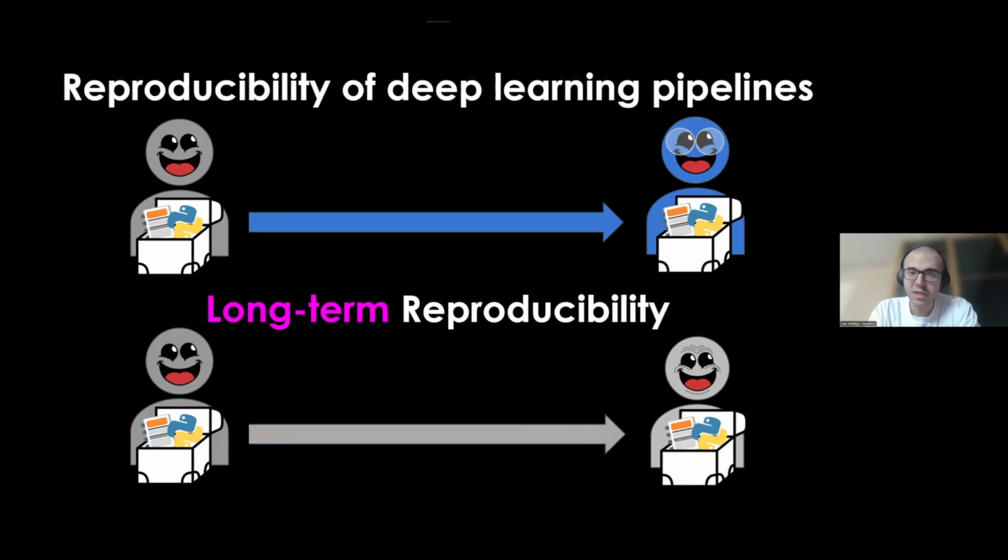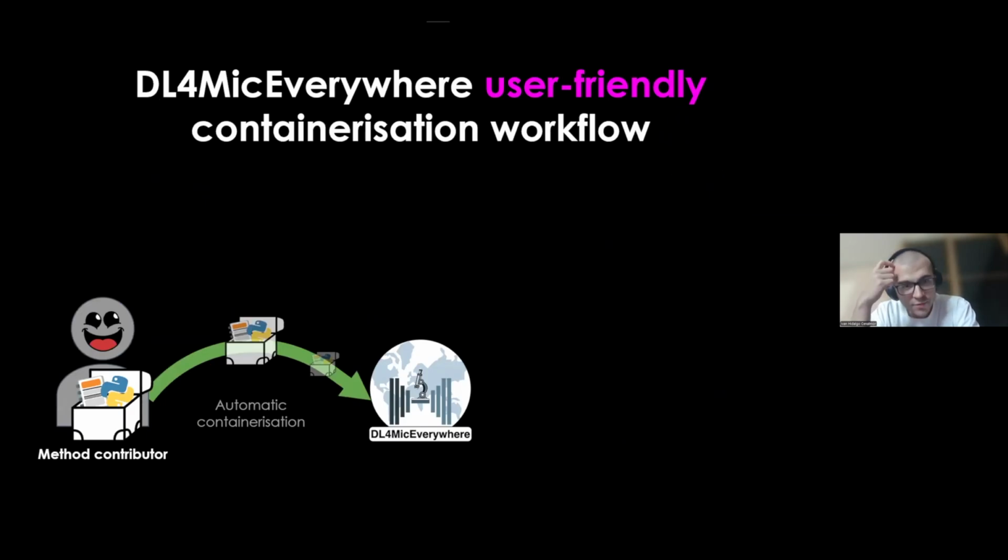And I know that this containerization thing might be overwhelming for non-computer scientists, but even for computer scientists, it might take some months to get comfortable using these things. So here, from the method contributor side, we wanted to make this process much more simple. The way that we did it is, when you have developed your really nice notebook and you have all the dependencies listed, when contributing to DeepLearning for MicEverywhere, we will take care of automatically containerizing it, taking everything and putting it in this container, in this box that I was telling you, so that you don't need to deal with this process.